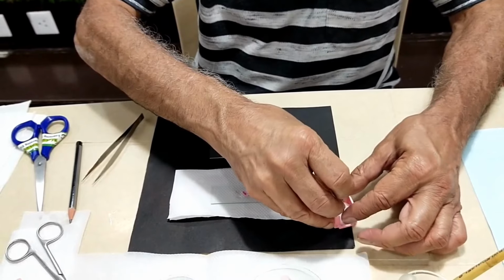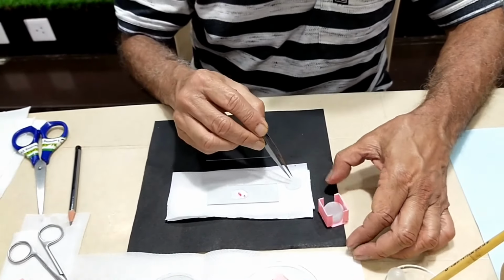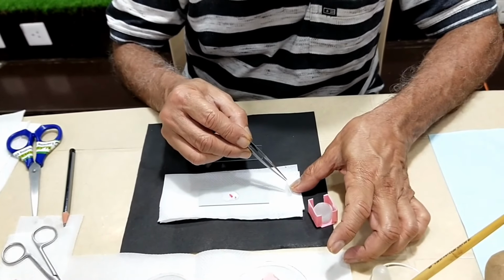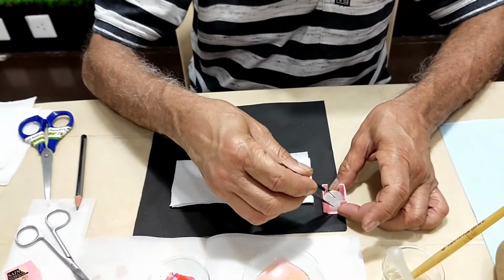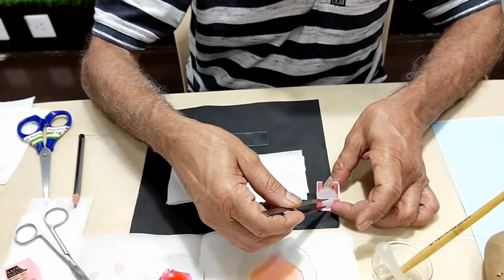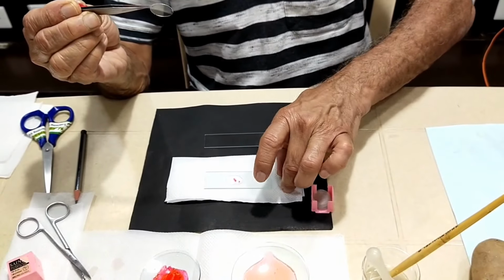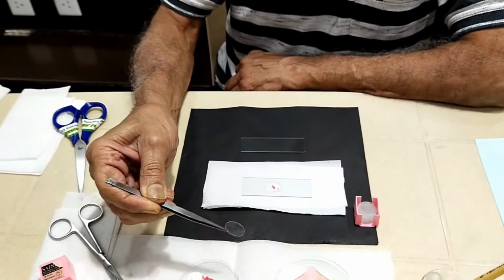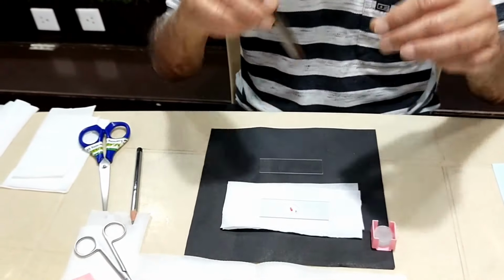Okay. I'll put them here, and I'll try to pick up only one of them. These are actually 2. So okay, they are stuck to each other. I think I'll pick up a simple, thin one. Yeah, here I can see. Can you see this one? This is very thin. I'll put these 2 back in position. So you can see this single one. And now what I'll do is I'll try to put this here.